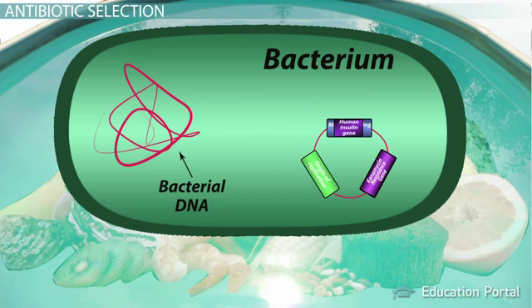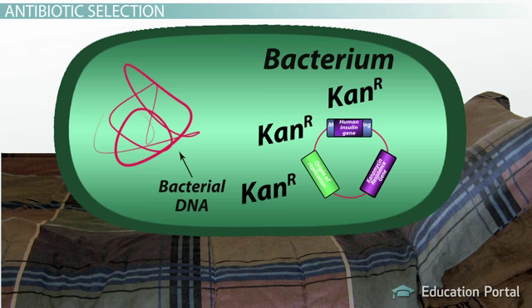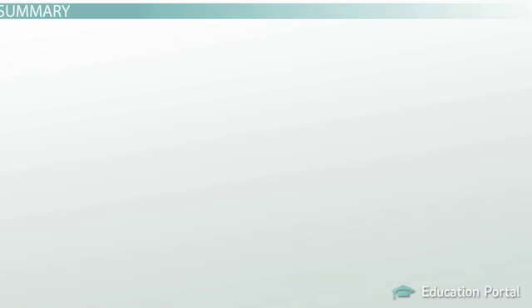However, since this protein is not needed under normal growth conditions, it's not produced until needed. Therefore, the recovery step gives the genetically engineered bacterial cells the time necessary to produce the antibiotic resistance protein that will protect them from the antibiotic selection.